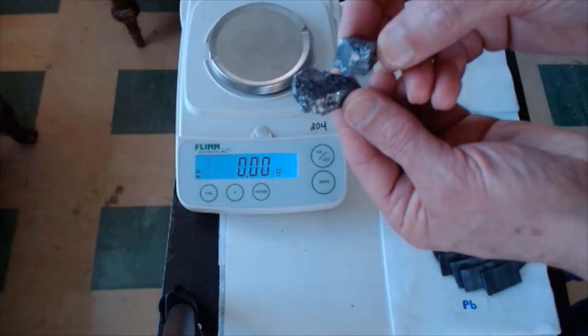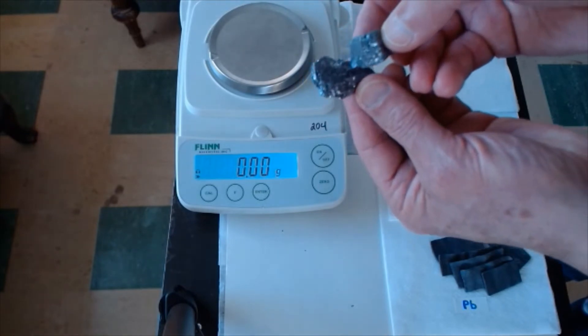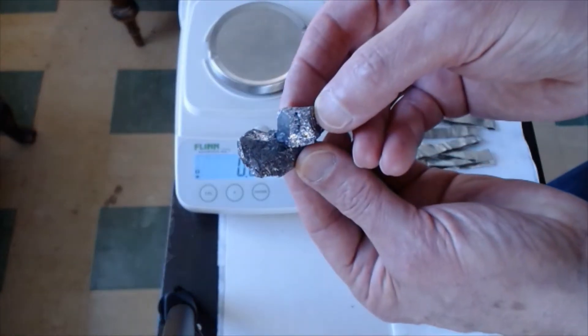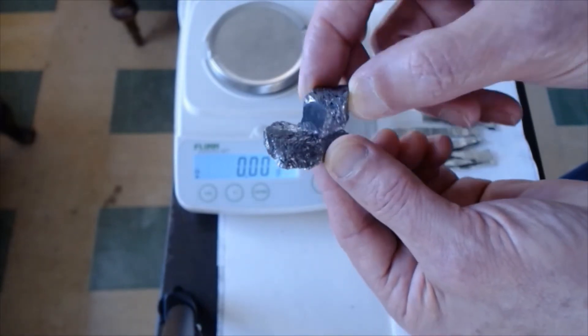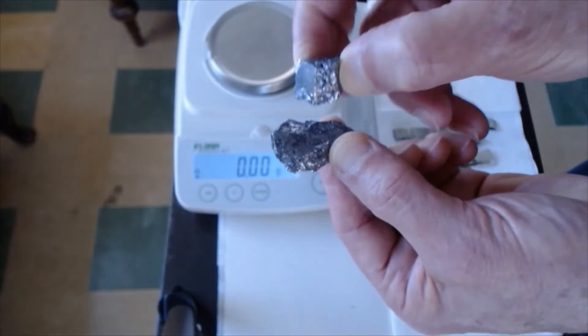You can see it's in the metalloid section of the table, so you would not expect it to look necessarily like a metal. You can see that it's kind of shiny and rock-like, kind of brittle.